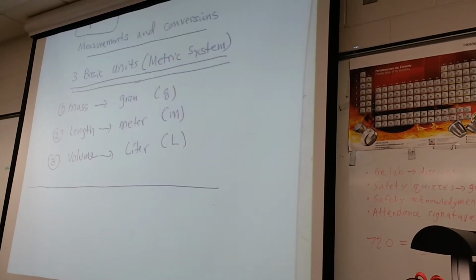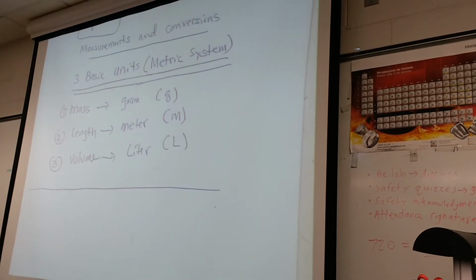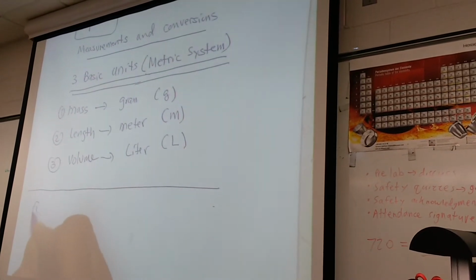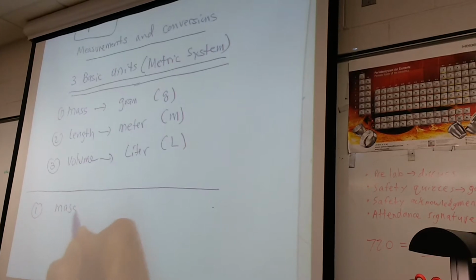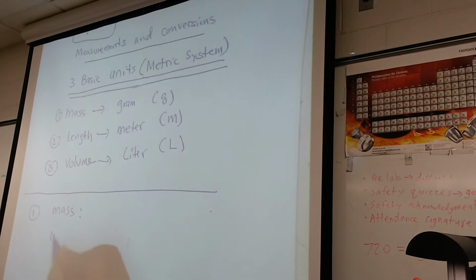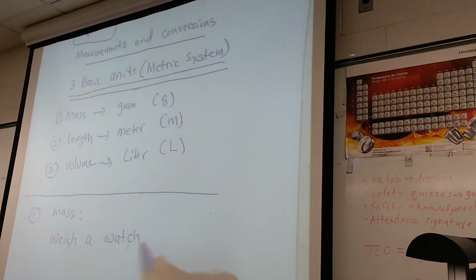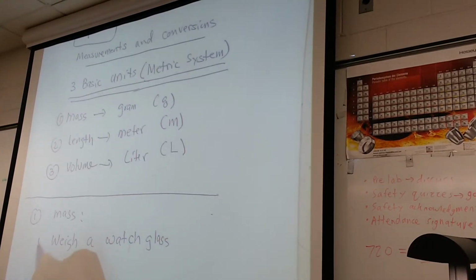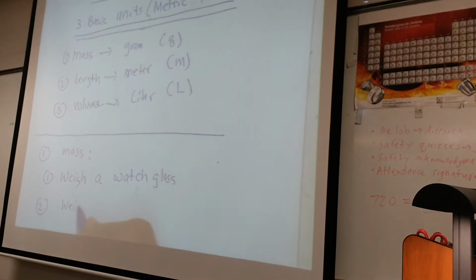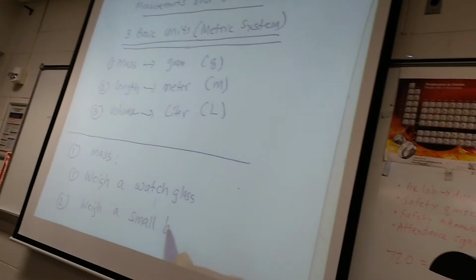So let's go first for the mass. The mass in your lab. So the mass you will have to weigh, correct? We have to weigh a watch glass, number one, and then you have to weigh a small beaker, correct?